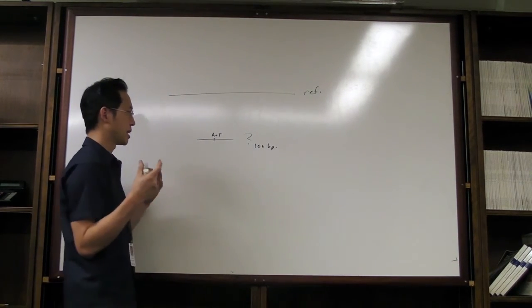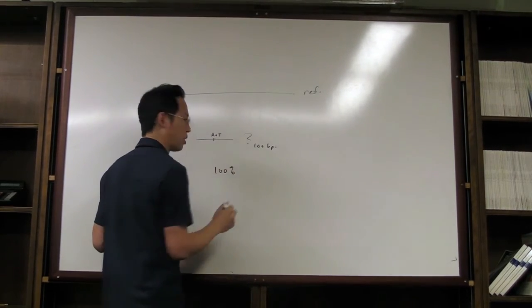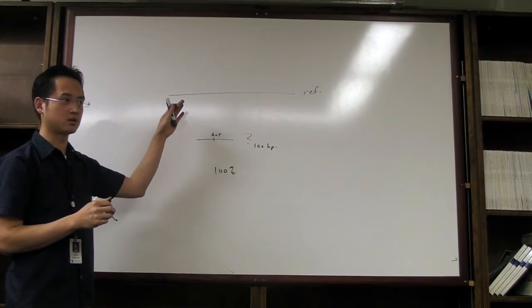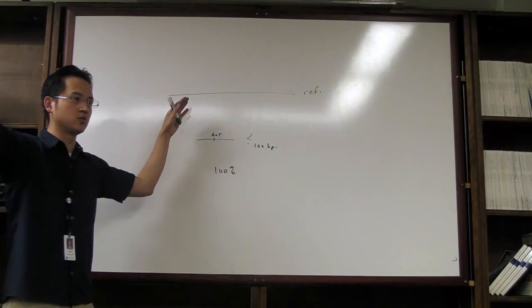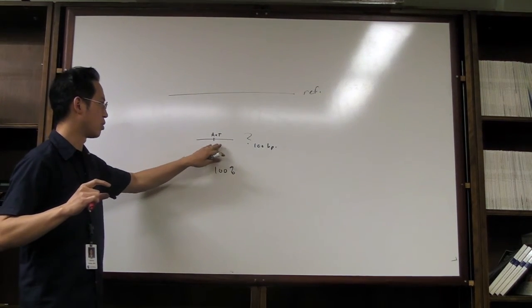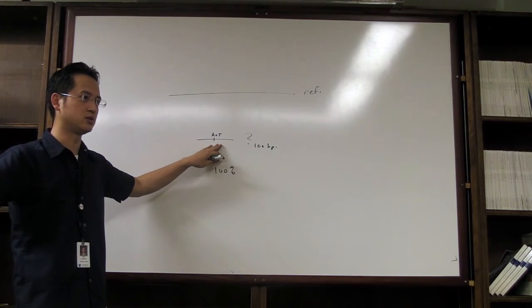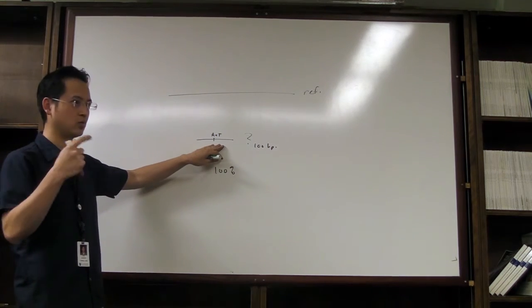So you can make it very stringent. I need this to match 100% to my reference. And it'll do that, right? It takes computing power to put this into RAM, so you have the entire reference in RAM, and it's going to do some sort of way to say whether or not this matches somewhere along the 3 billion bases that's part of the genome. That's a very difficult question and problem, but the computer will do it for you.